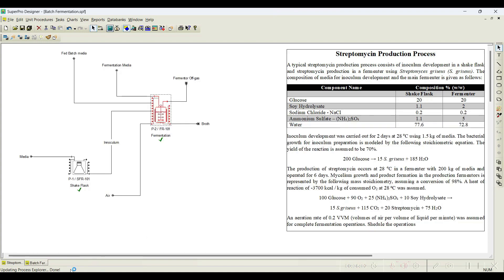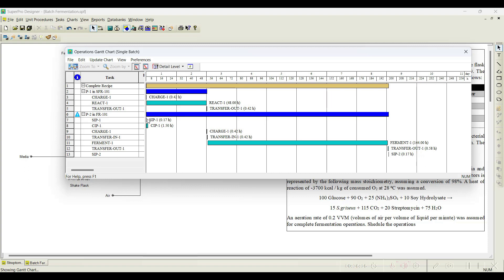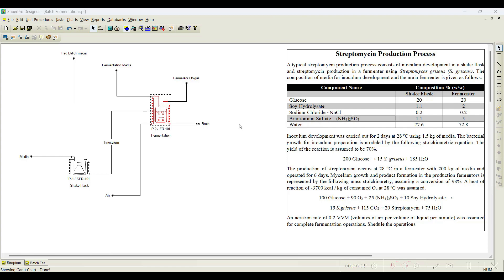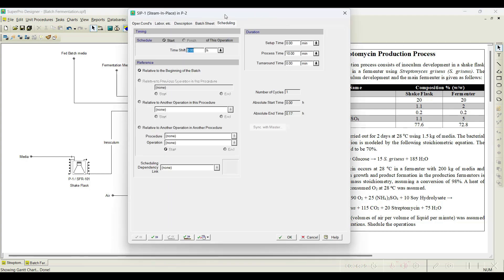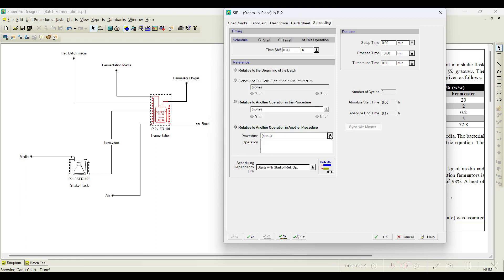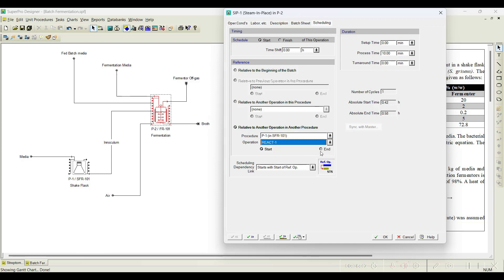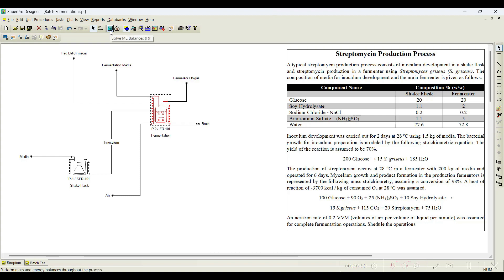You can notice we just added the cleaning procedures. If you go to the Gantt charts, there will be a scheduling issue because we have not initiated the timing correctly — it is starting from time t=0. Go to steam in place, go to scheduling, and set when the steaming should start relative to the previous procedure. Once the react operation in the shake flask reactor is completed, we start preparing this fermentation system — so I will relate it to the end of the react operation. Click OK; the remaining operations will follow according to the previous operation in the same procedure. Run it and go back to the operation Gantt charts.